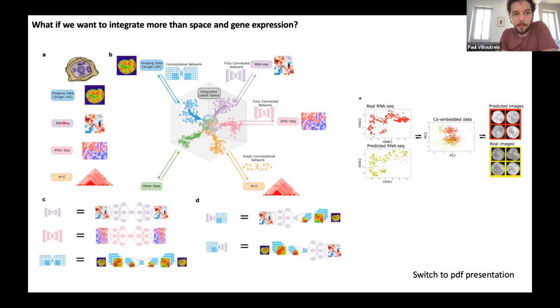You can measure the content of RNA within each of the cells. You can measure the position of histones. And you can measure how the DNA is organized in 3D. Okay, and the idea of this paper is to combine these different aspects by using coupled autoencoders. I'm assuming that you're familiar with the idea of autoencoders, but stated very quickly, an autoencoder is a deep learning structure or architecture where you give an input.